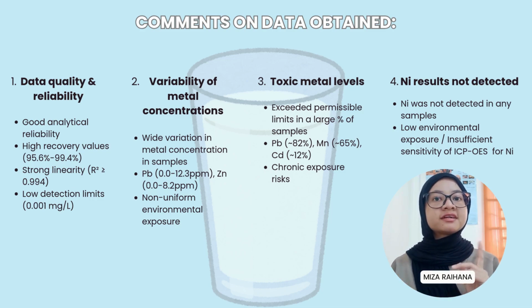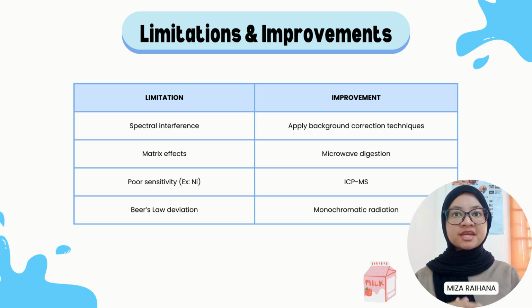And finally, the article claimed that nickel was not detected in any sample. This may be due to low environmental exposure or insufficient sensitivity of ICP-OES for ultra-trace nickel. Since Aisha already shared the advantages of ICP-OES, let's move on to the limitations of the analysis and its improvements.